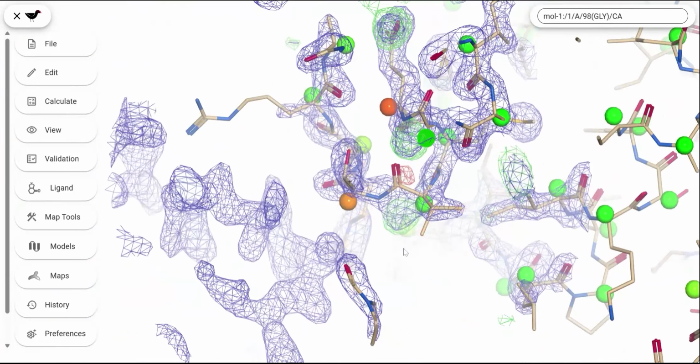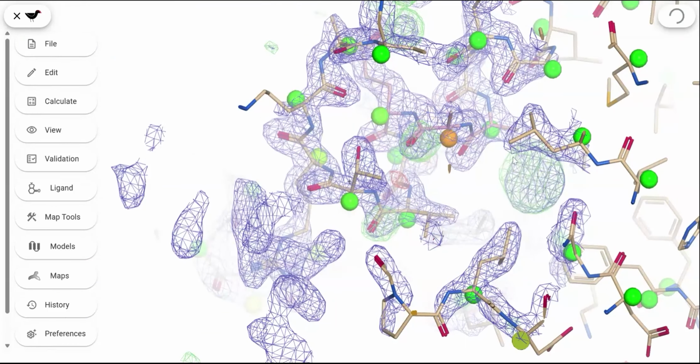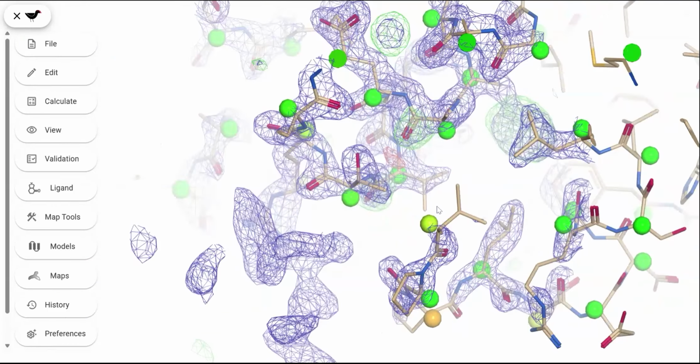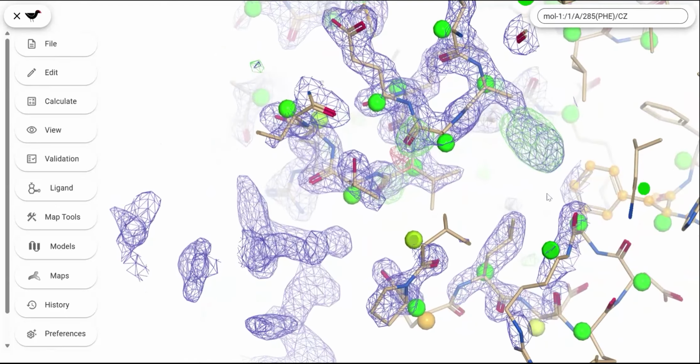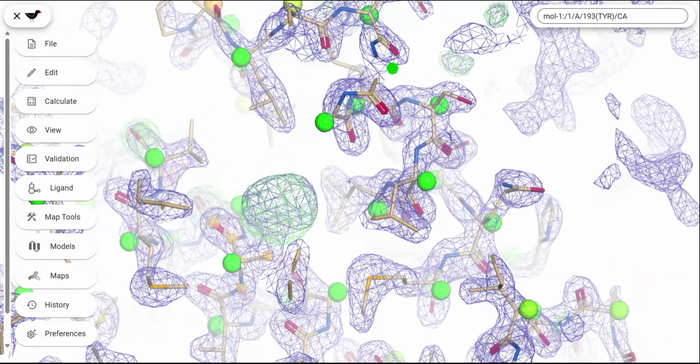Okay, oh yeah, that's definitely clearly in the wrong direction. Let's go ahead and fix that. There we go. This one's also in the wrong direction. Let's fix that. There we go. And oh, hey, look, there's actually something over here. This is not part of the backbone. This is from shooting off the C alpha, a side chain residue. So if there's something over here and it's connected to that residue, it's clear that this is coming off from the N, C alpha, C prime.